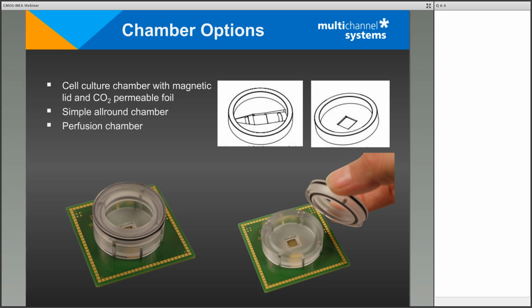Okay. Another question was whether the activity of a single neuron is recorded by several electrodes. So, how many electrodes record the same neuron? I can't say exactly how many, but I would guess that, of course, it also depends on whether you have a 32 micron or a 16 micron sensor pitch. But I would say at least 9, maybe more. With a 16 micron sensor pitch, let's say the cell sits directly on one sensor, you will get all the ones around, definitely, and maybe even the second row around that. That would be my guess. Okay.